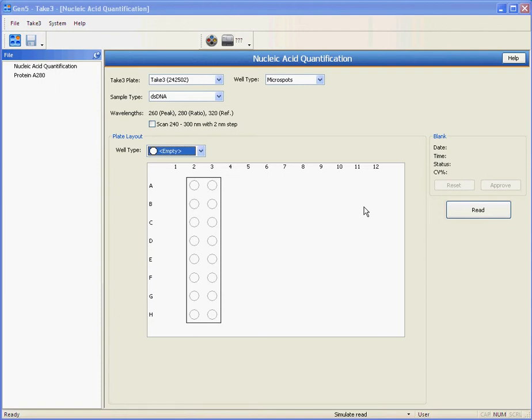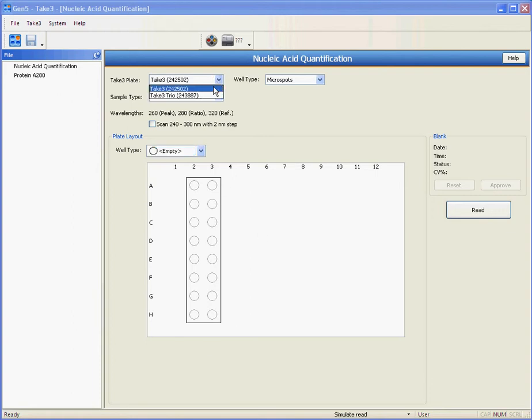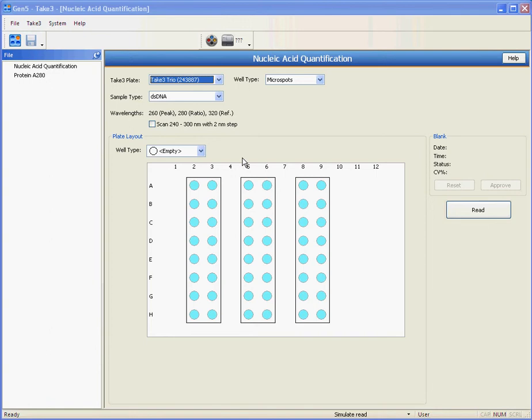The TEK3 interface has been updated in Gen520. The first thing you will notice is that this interface has been designed to support both the existing TEK3 plate with one slide as well as the new TEK3 Trio that can be equipped with three slides and allows measuring 48 samples in one run.